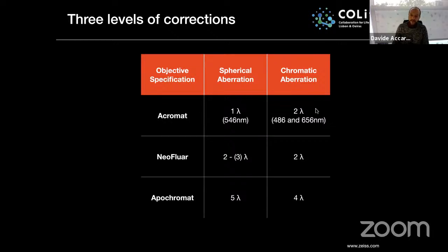In fact, because of this chromatic aberration compensation between, let's say, the blue range of the spectrum and the far red range of the spectrum, when imaging, like focusing in the middle of the spectrum, let's say, where the green light is focused, we have in bright field with this objective a magenta halo.